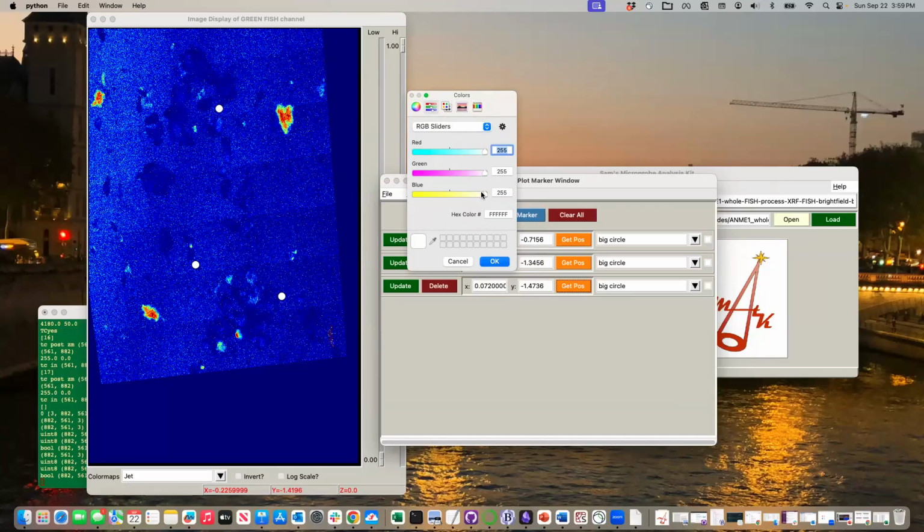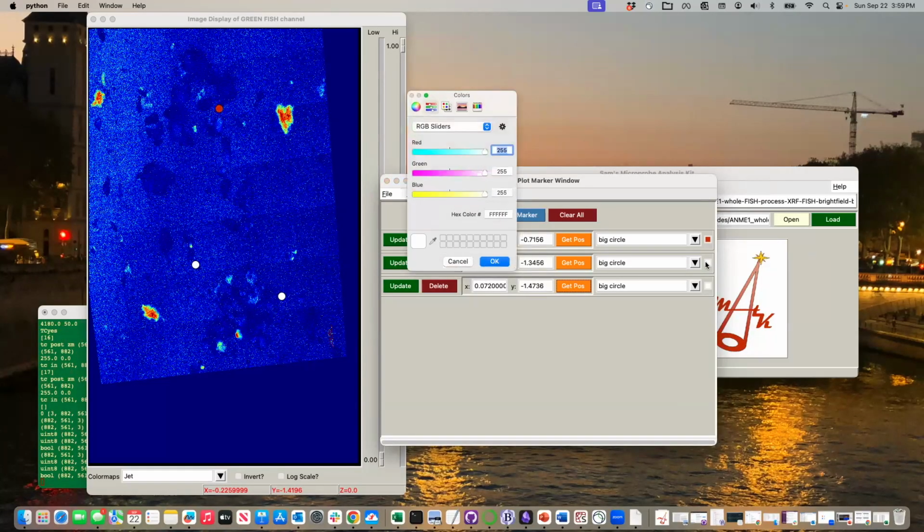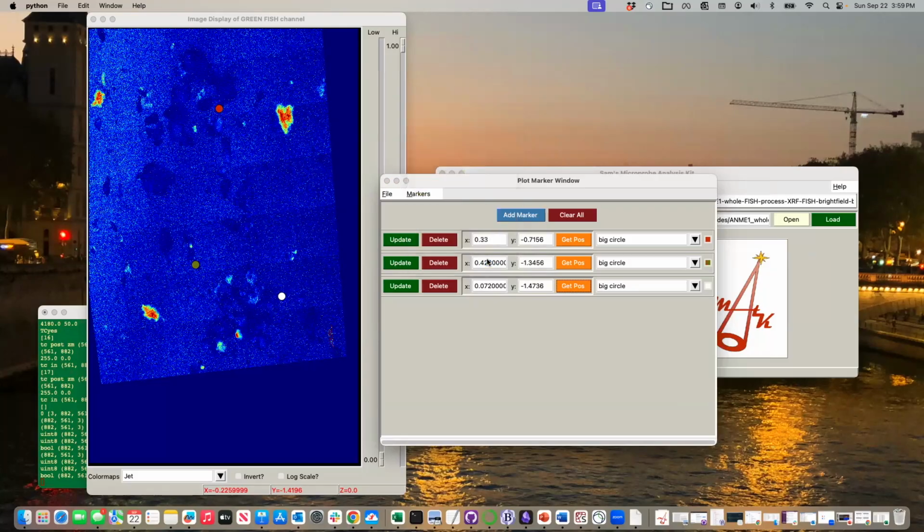So this one here, let's say if I'm doing just a 2 plot, I'm going to do this by eye, but that's about, say, 80-20 here, right? Okay. This one here is going to be 0 here. I probably could type out the hex values correctly, but I just can't be bothered to do math in my head right now. That's that one.